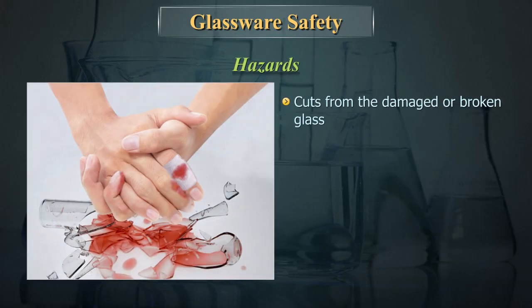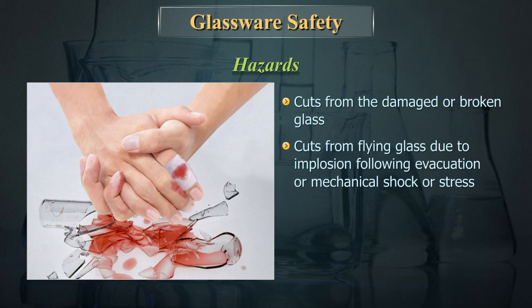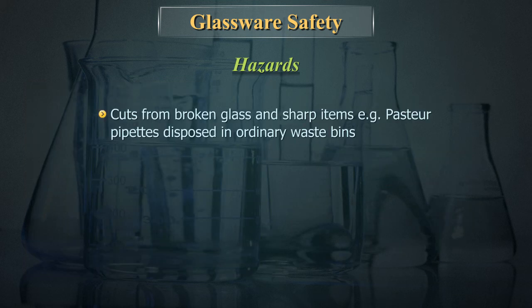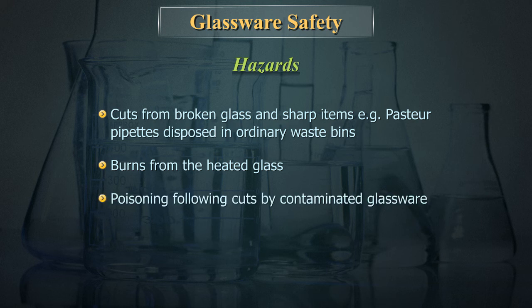Key hazards include: cuts from damaged or broken glass; cuts from flying glass due to implosion following evacuation or mechanical shock; cuts from forcing plastic tubing, teats, or rubber bungs onto glass tubing, pipettes, or condensers that break; cuts from broken glass and sharp items disposed in ordinary waste bins; burns from heated glass; and poisoning following cuts by contaminated glassware.